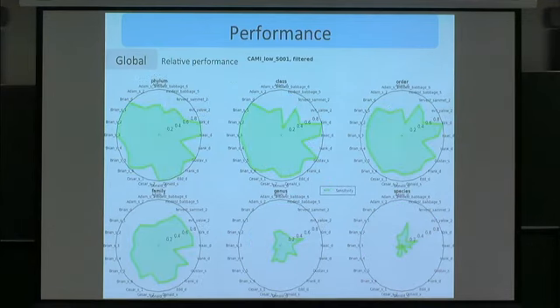To go to a different error metric, I was only given the low complexity samples, so that's the only sample we get to look at. For sensitivity, once again, parameters matter. Notice the big dip for modest Babbage 5 and 6, those two different settings.